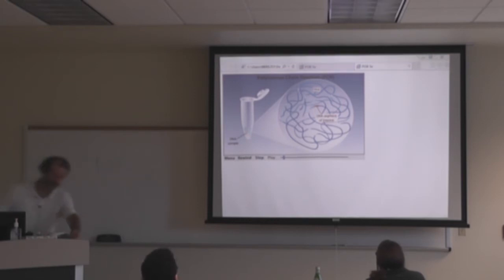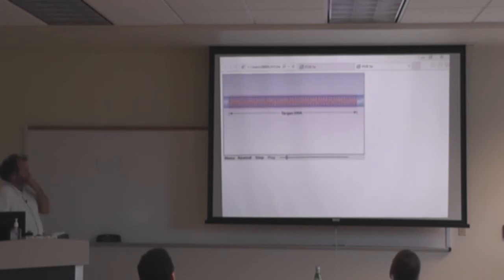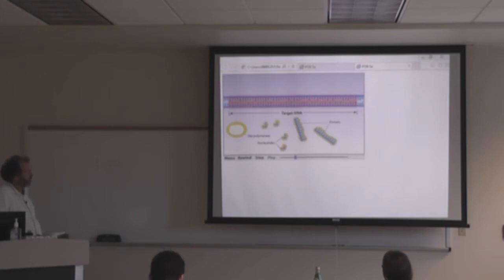single copy of a DNA segment into billions of identical copies. The DNA segment of interest, or target DNA, is indicated in red. In addition to the target DNA, a PCR reaction contains several other ingredients. These include free nucleotides, DNA primers, and the enzyme Taq polymerase. The primers are typically about 20 nucleotides long and are complementary in sequence to the ends of the target DNA. Taq polymerase is derived from hot springs bacteria and can tolerate the intense heat of a PCR reaction.